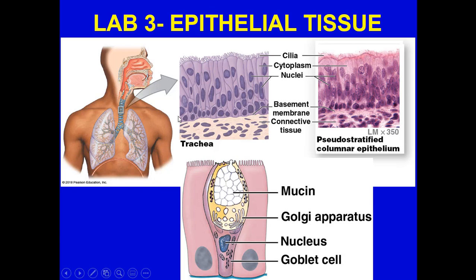Remember how I said with all the columnar cells, you'll always have them start off somewhat round-like, but then eventually they start growing and expanding and eventually become columns. How can you tell pseudostratified from basic stratified columnar? Well, one thing is this. You're going to see irregular patterns here, not a set of a layer, then another layer, then another layer, then another layer.